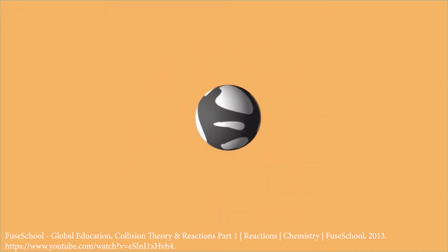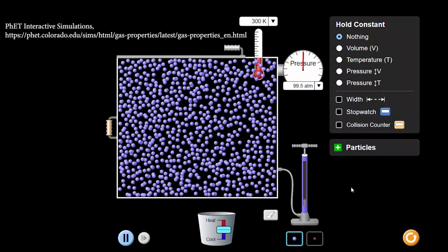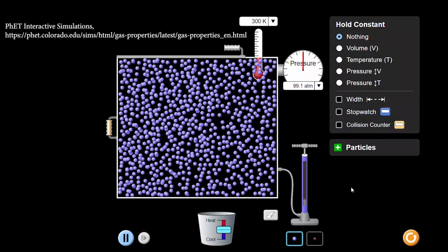Now, we keep the instrument in vacuum because we do not want boom. We don't want these ions that we create to collide with each other. Ions are pretty unstable. They're going to respond beautifully to our electrical and magnetic fields, but they're pretty unstable, and if they collide with each other, then we get reactions. A lot of times we neutralize our ions, but we don't want that to happen. So in this simulation, we can see that at higher pressure, we have all this gas in there colliding with each other all the time, and there's a really high likelihood of reactions.